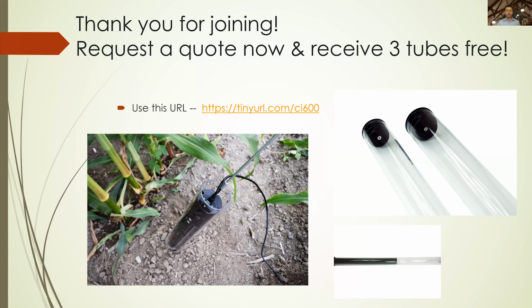Currently, next question is, what is the technology used in the scan? Is it the visible light? Currently, yes, though we are actually looking into further technologies, including different LED pigmentations, some light NIR, not too far into the range, and also some UV, and seeing how that can be readily added to the scanner. We're not ready yet, but we are researching it.